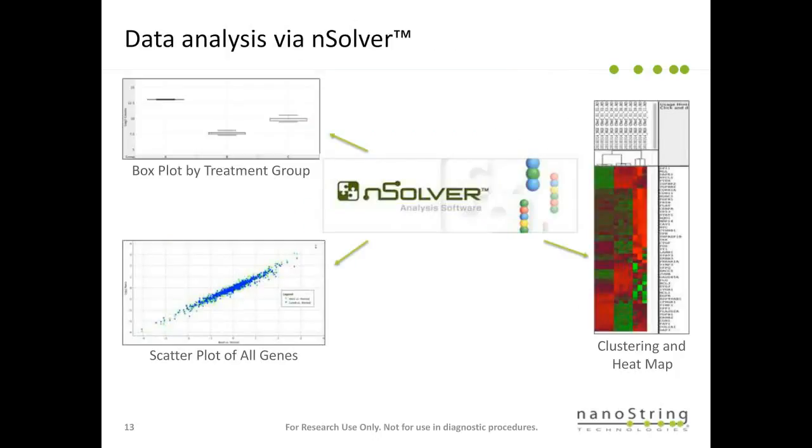That's really the basics of what you can get from those samples. We also provide a free software called nSolver, where you can download the data from the digital analyzer and put the data into nSolver. nSolver can perform all the background subtraction and all the normalization for you, and also build the ratios between the samples.